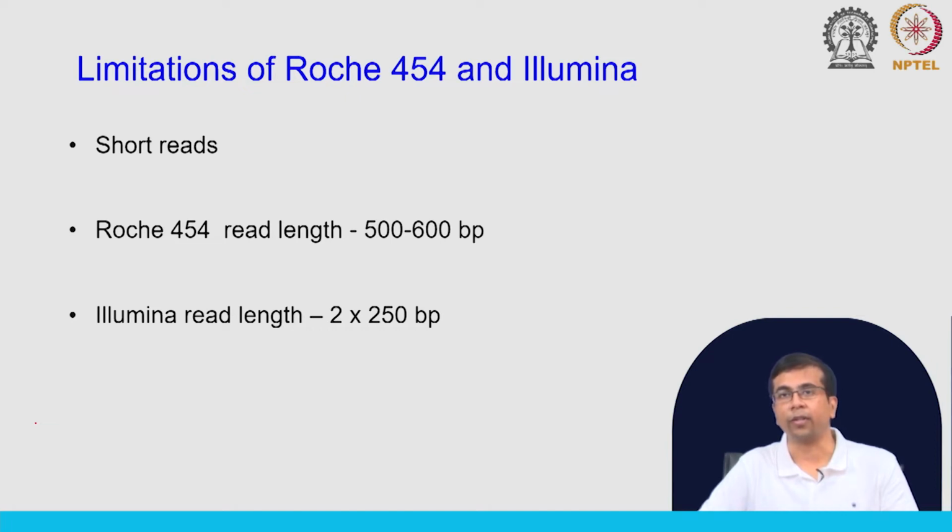On top of that, we will have structural variations. We will talk about what structural variations are in the next classes. When we talk about variant calling, you will understand that, and especially for resolving structural variants, these short reads are not really suitable, and we would like to have really long reads, right. So, longer reads will be much better. If you compare Sanger sequencing, we have 1 kb, but can we get at least 1 kb, and if we get more than that, that is something that will be very helpful for genome assembly.